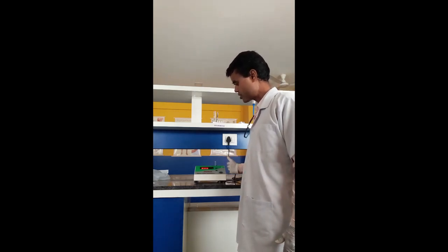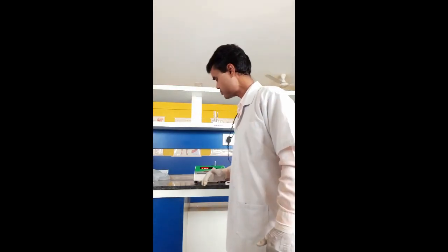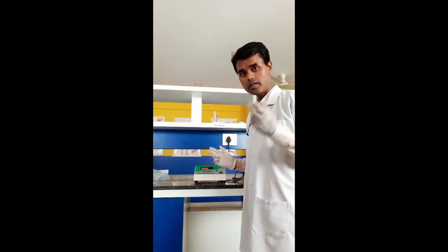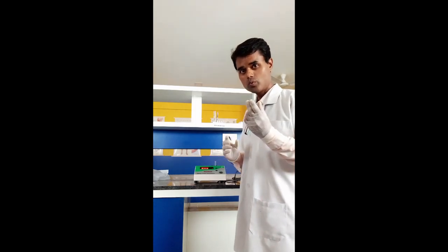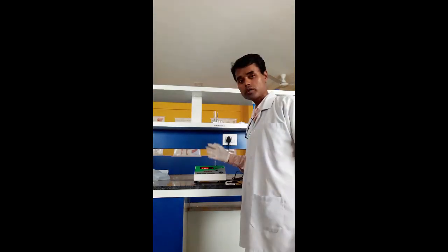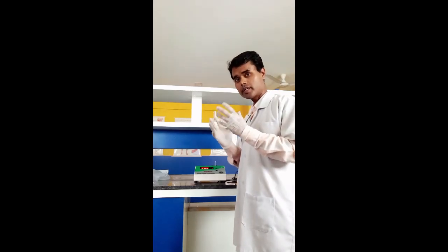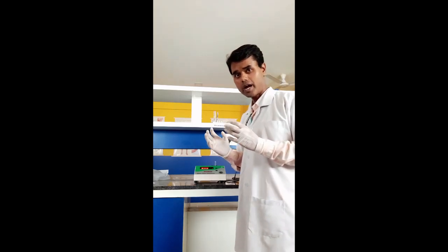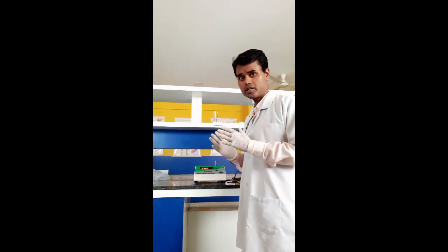different components on which this colorimeter is working. So when we switch on this instrument, the light is generated because there is a bulb inside. Now that bulb will produce some rays of light which will go and fall on the filter first. So what is the function of the filter? To block all other lights, rays, and pass only the color which we are interested in.